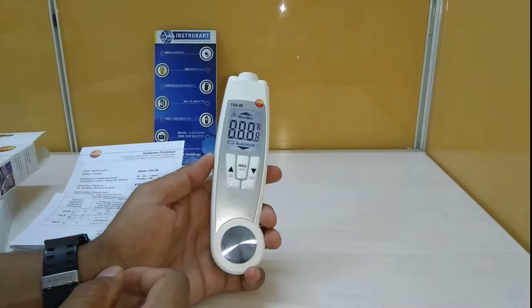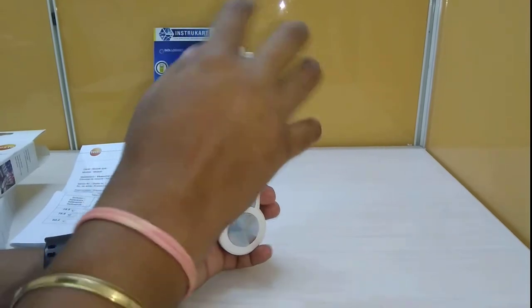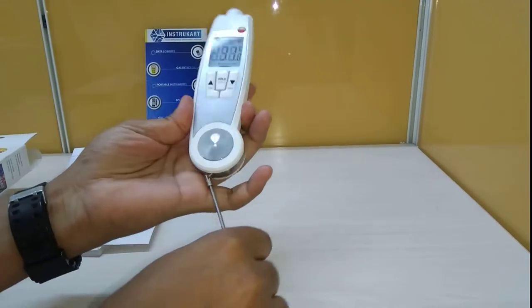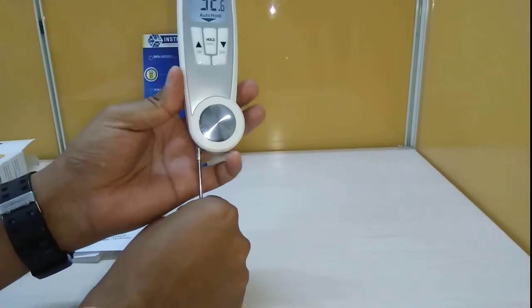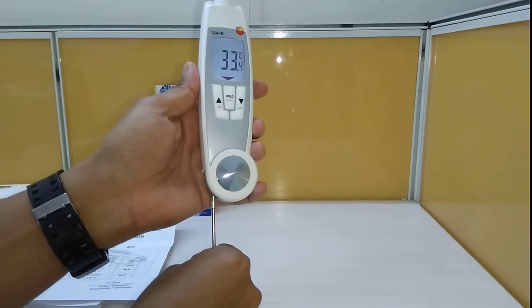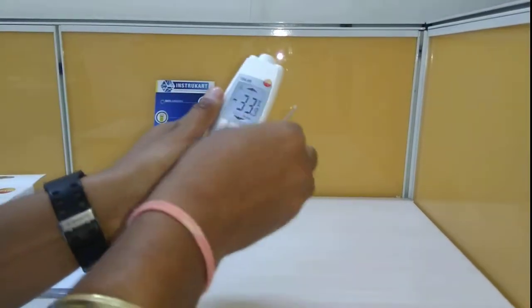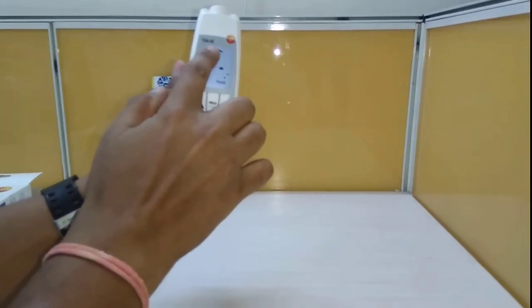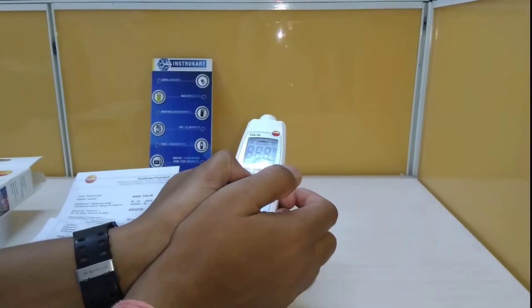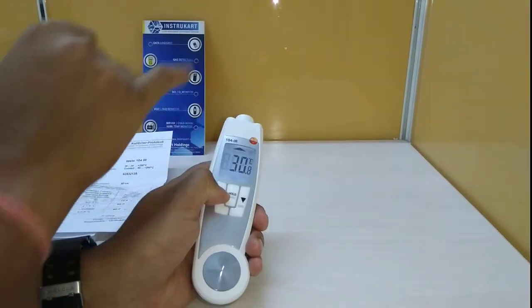This particular instrument has a dual sensing type — one from the infrared and the other from the probe. As you can see, the probe opens and the moment the probe opens it is showing the down arrow, which means the temperature for the probe is being recorded. The moment we close it, the up arrow is shown, which means it has switched to infrared temperature measurement.